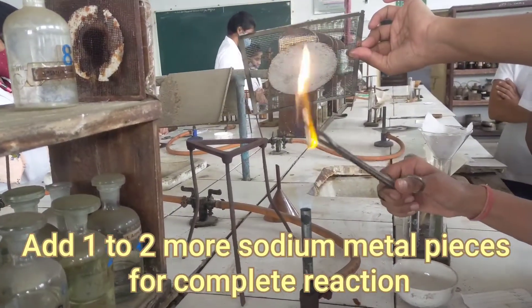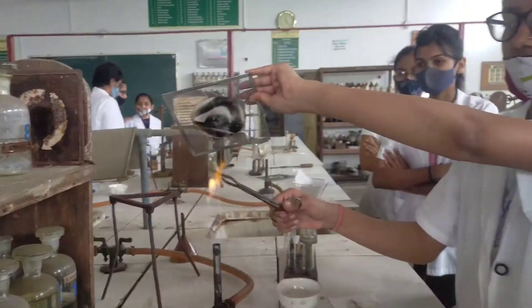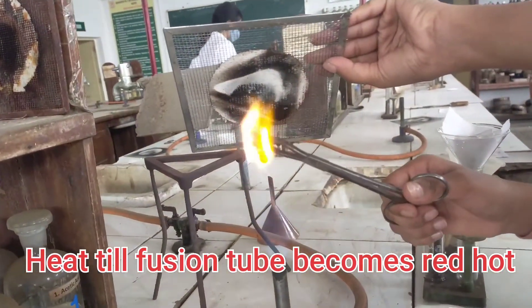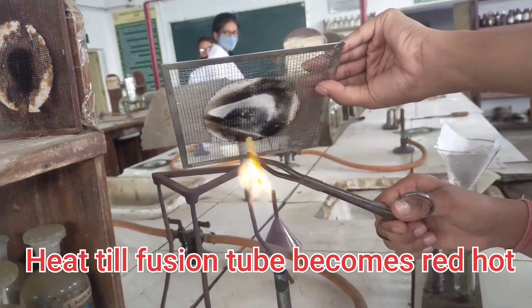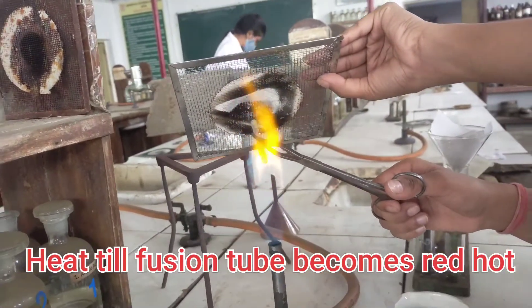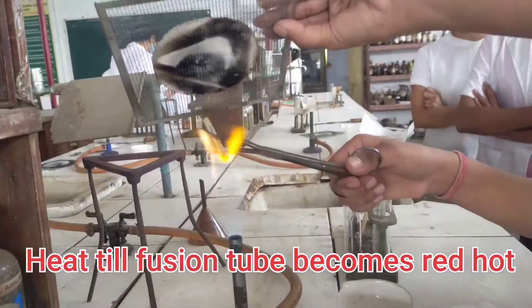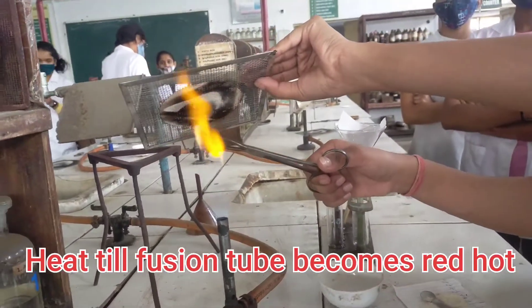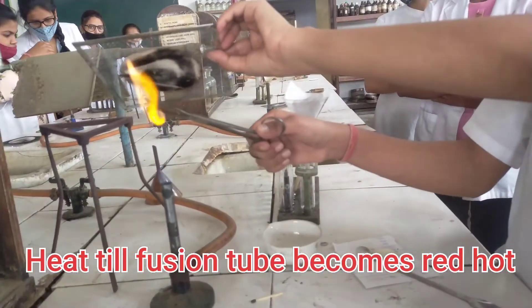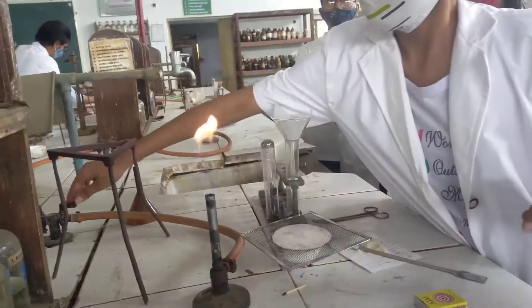Heating with safety precautions by using wire gauze is a must to avoid any accident. Heat this fusion tube till it becomes red hot. Here the stage is where the fusion tube appears red hot. Now, as we have already taken some distilled water inside this china dish, we have to plunge this red hot sodium fusion tube inside this china dish. This is the very right procedure for making sodium extract.